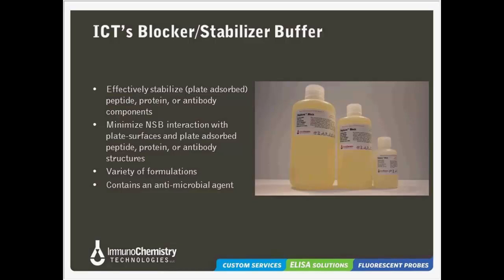So just take that into consideration. There are different blockers, and there's different blockers for a good reason, because there are situations where one type of blocker with one type of additive will work better than in another case where the other additive is added and it works fine. But sometimes it becomes kind of a treasure hunt to find which one works the best. But you have to at least try that out if you want good backgrounds in your assay.